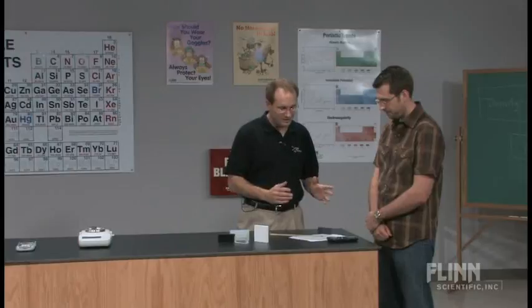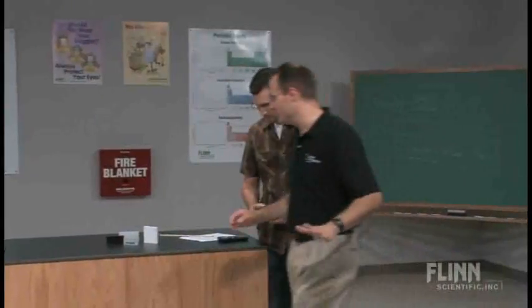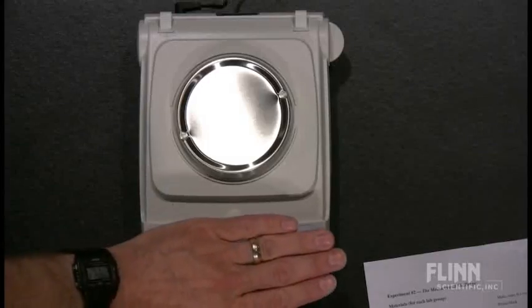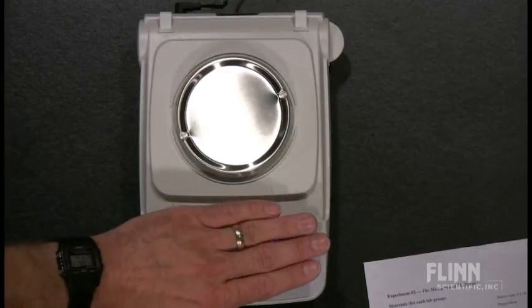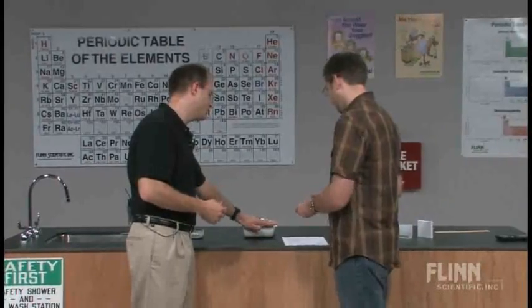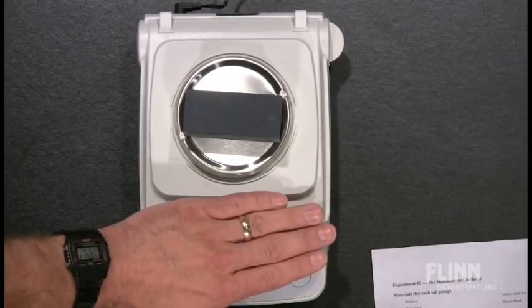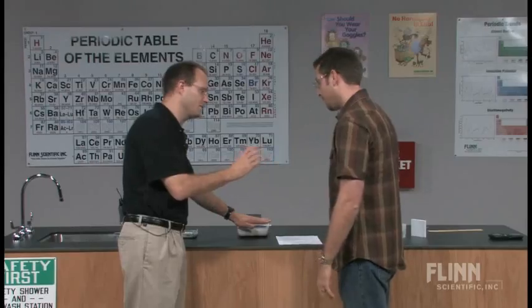So what we're going to do is we'll take the block. And let me zero the balance. Zero it. And I like to cover up the numbers here like this. And let's see, what was the predicted mass? 102.07. 102, okay. 102 grams. Go ahead and put it on there, please. And how do you feel about this? You feeling pretty confident? Nervous. Nervous, okay. Sorry. It's a 3%. I'll give you 3%. 3% difference, 3% error.